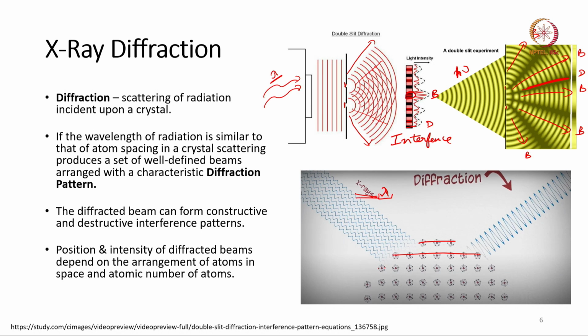Whenever we have a material, its atoms are arranged in a unique crystal lattice. They have a regular arrangement in the crystal structure, and the distance between these planes, and the regular arrangement of atoms inside our material, gives us something called the interplanar distance, represented as d.